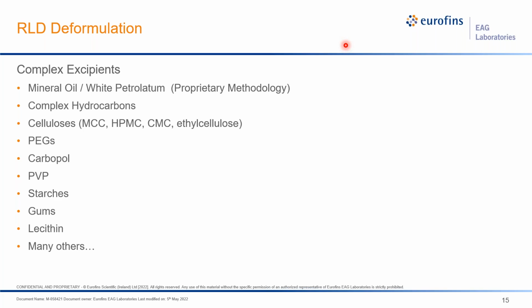Typically, what you're doing is isolating those materials from everything else. You're running it through a GC chromatogram and identifying the grades of mineral oil and petrolatum. Then from there, you basically need to either have placebos or mixed standards of different materials to compare against. The process itself is not straightforward. Really, we're going to quantify total hydrocarbons, and then we have to speciate from there. How much of this total hydrocarbon is mineral oil, petrolatum? What if there are more hydrocarbons than just mineral oil and petrolatum? And we've seen that before.